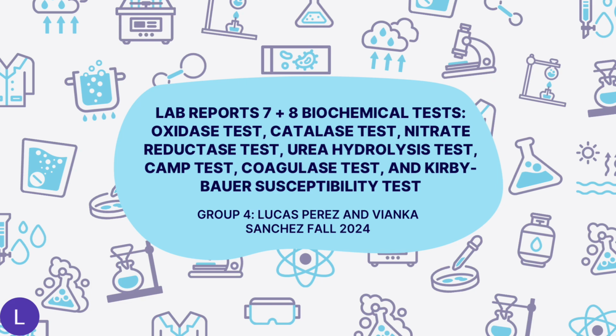And this is the lab report 7 and 8 combined, the biochemical tests of oxidase test, catalase test, nitrate reductase test, urea hydrolysis test, CAMP test, coagulase test, and Kirby-Bauer susceptibility test.